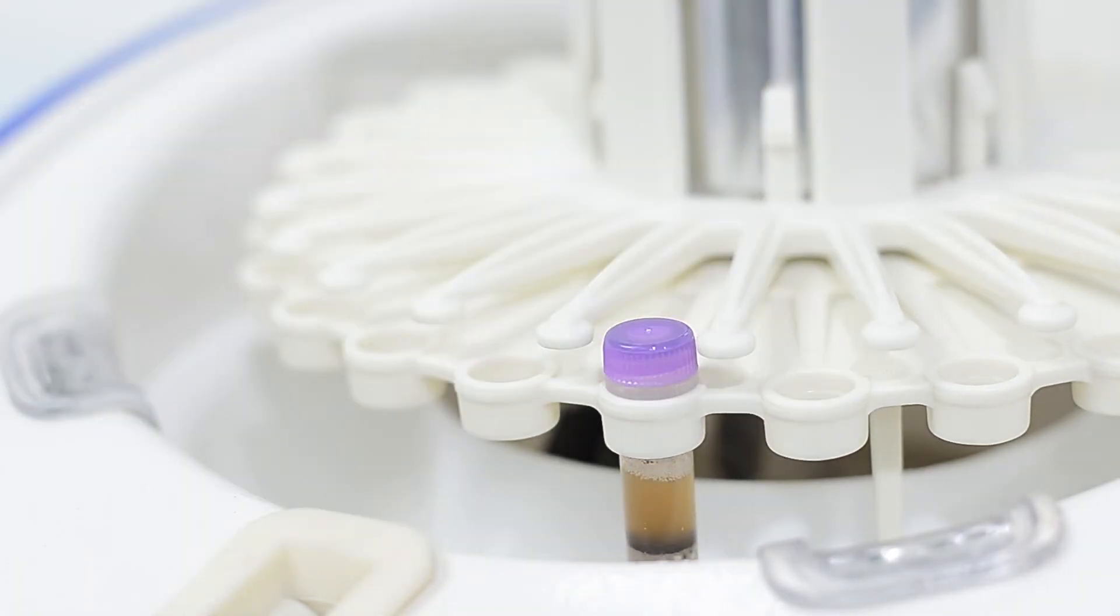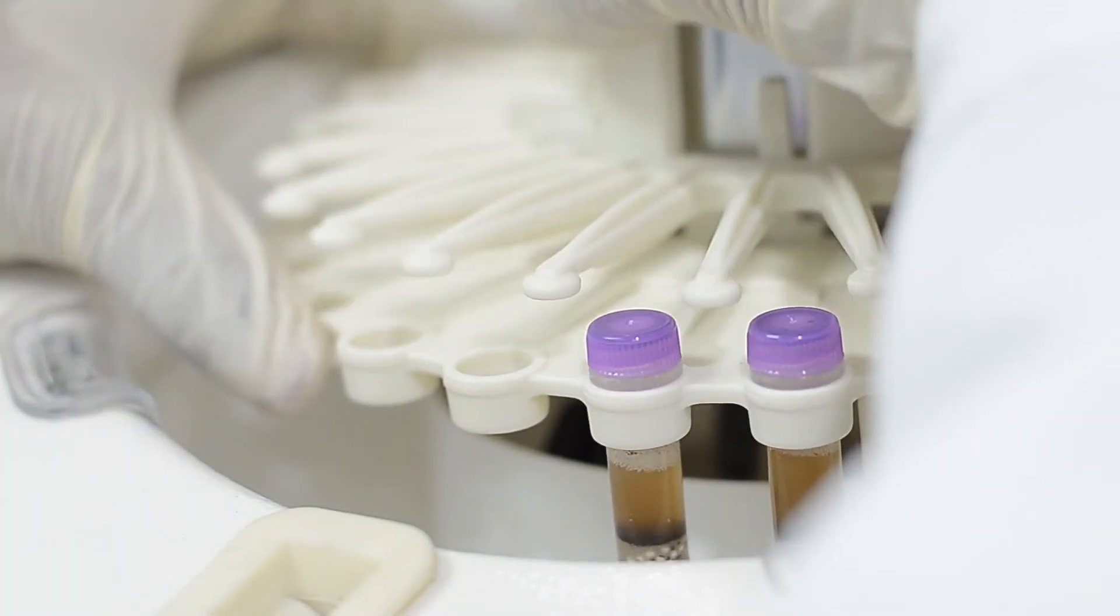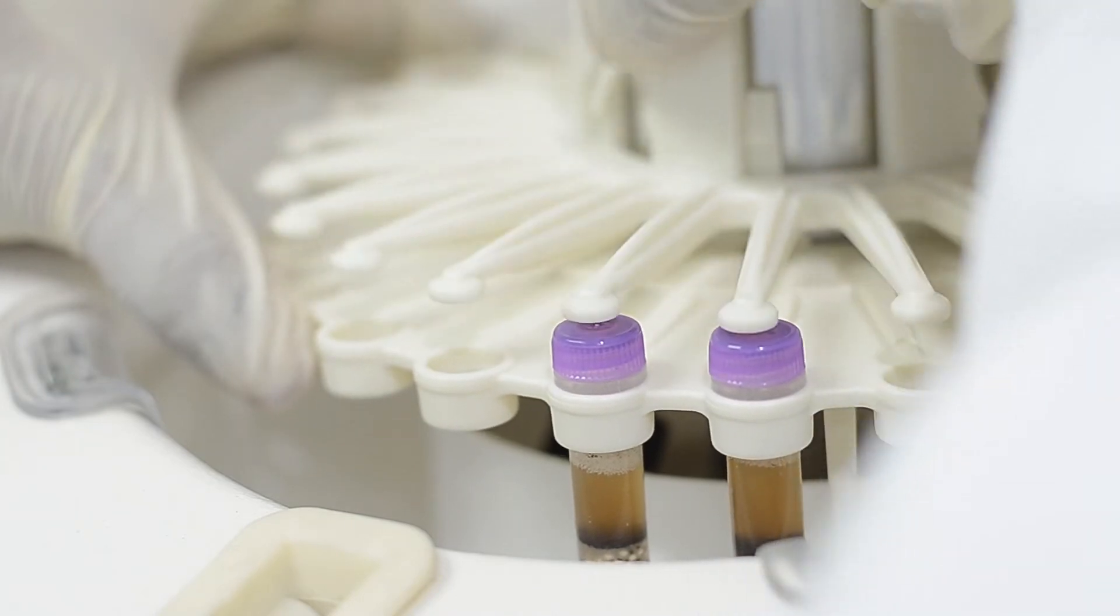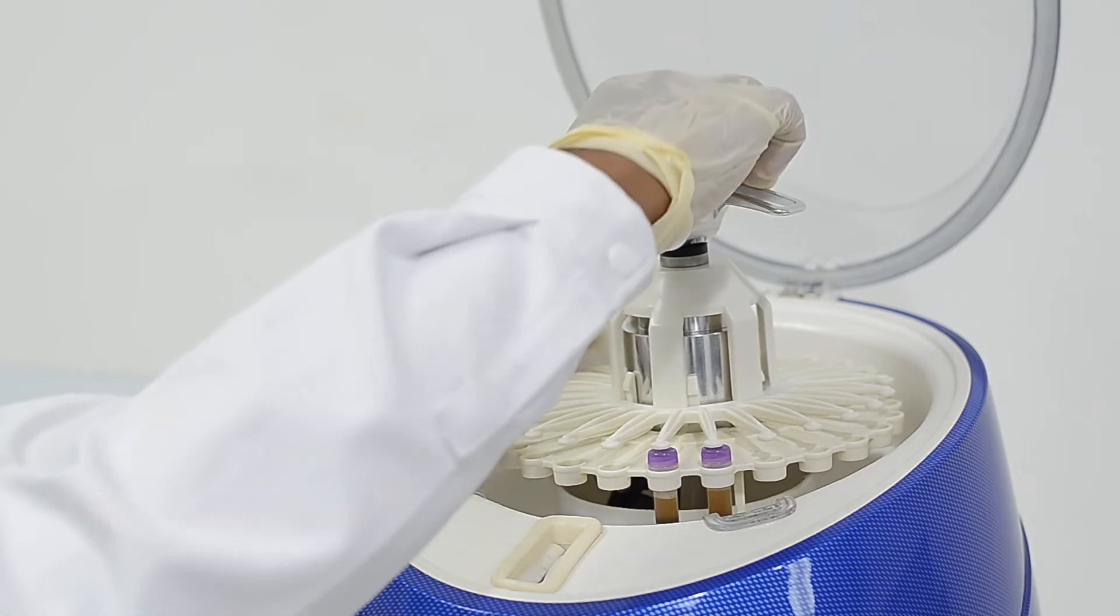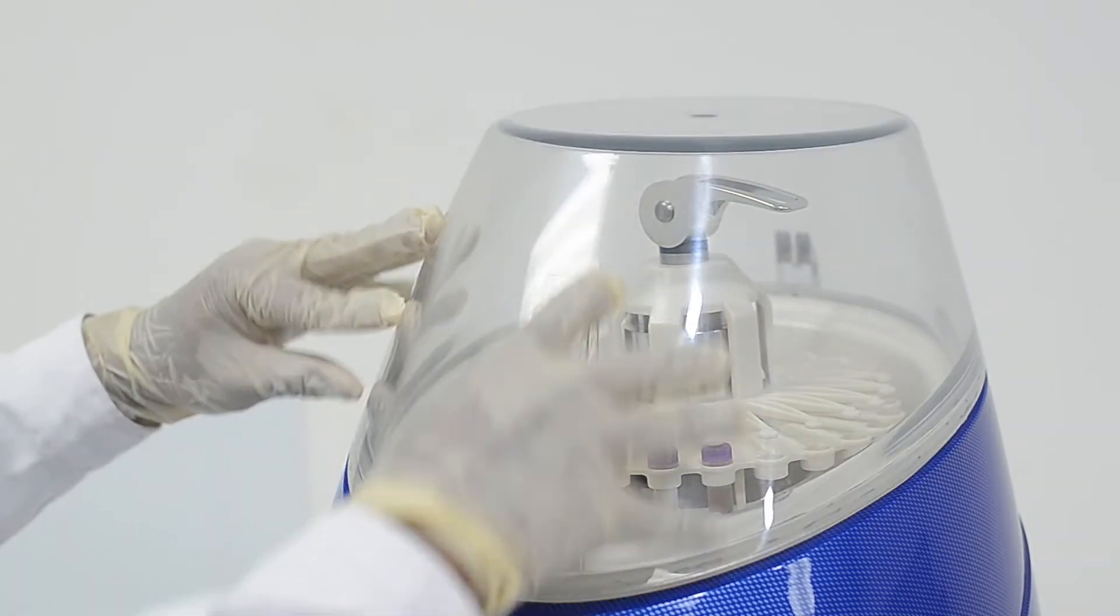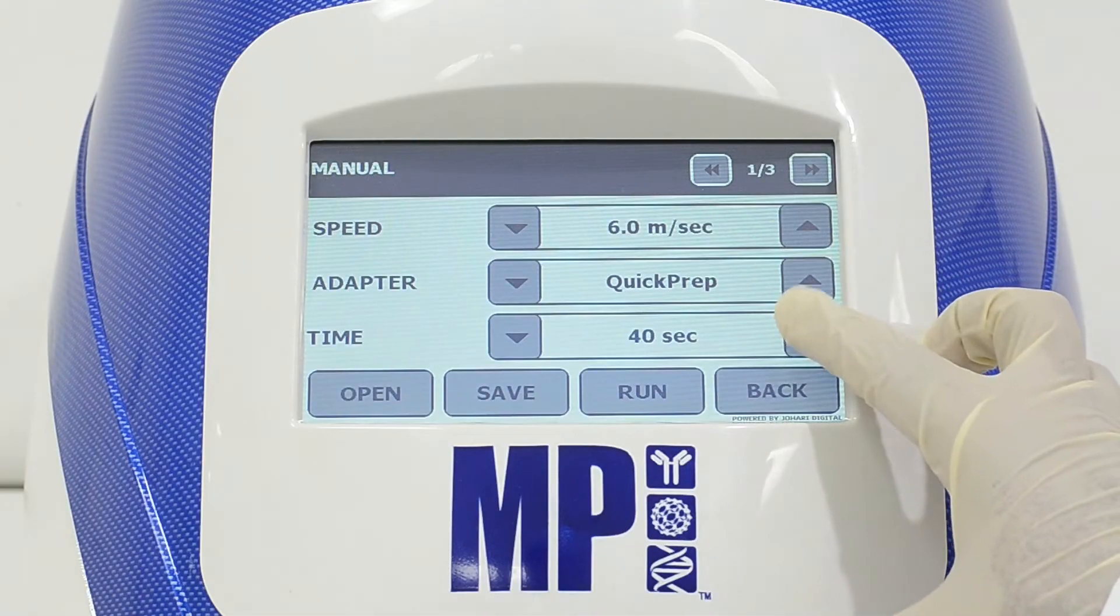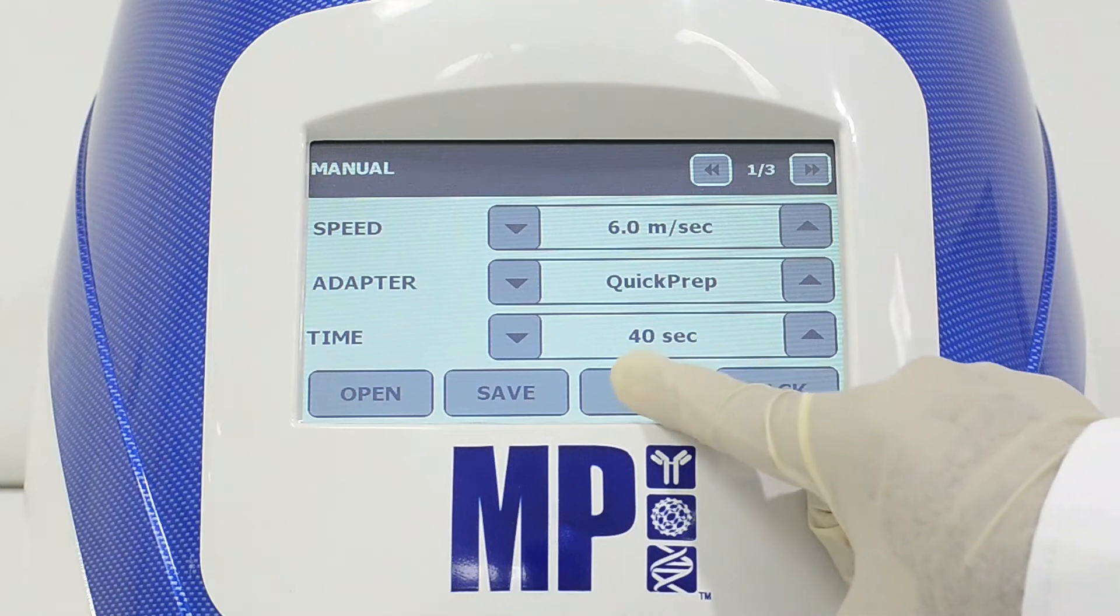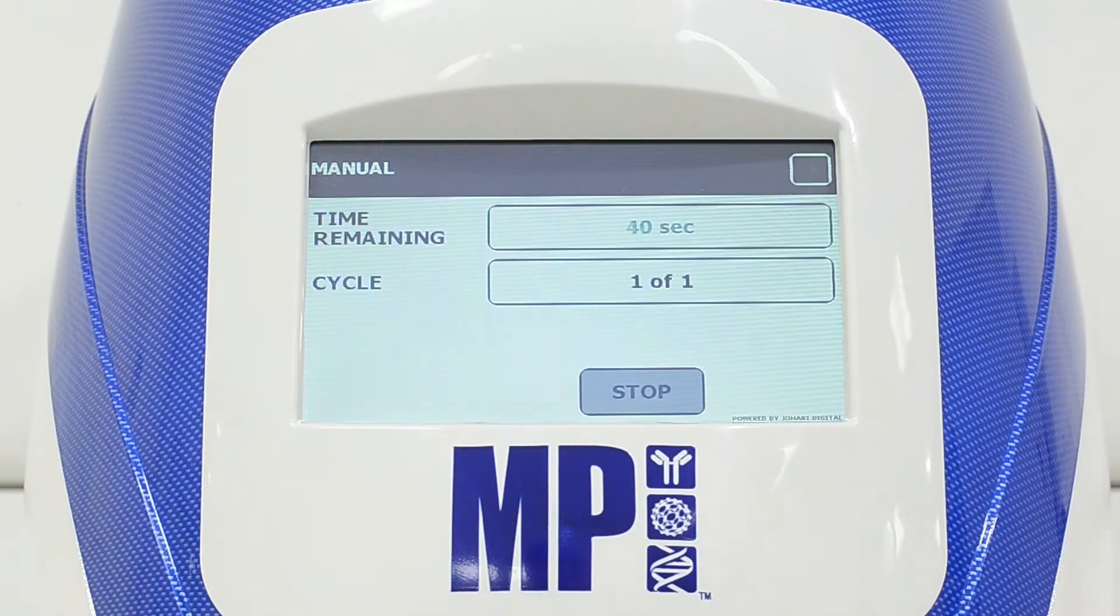Fasten the mixture to FastPrep instrument. Homogenize sample for 20 to 40 seconds at speed setting of 6 meters per second. The speed and time can be changed accordingly to different soil samples.